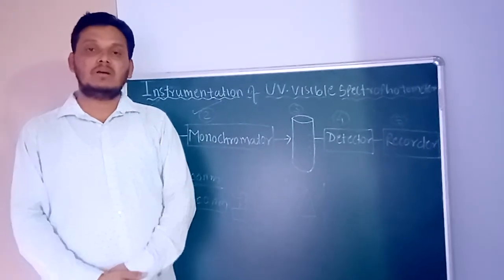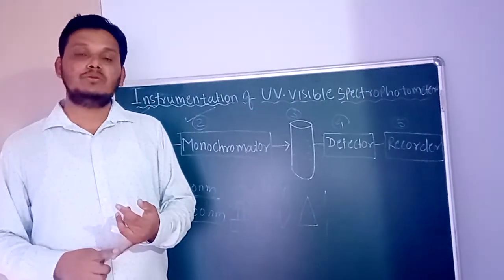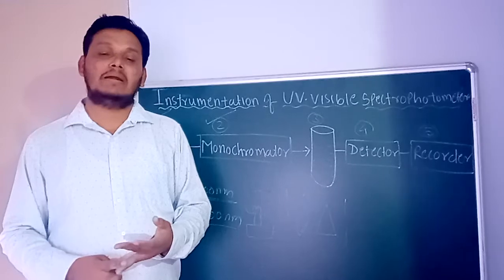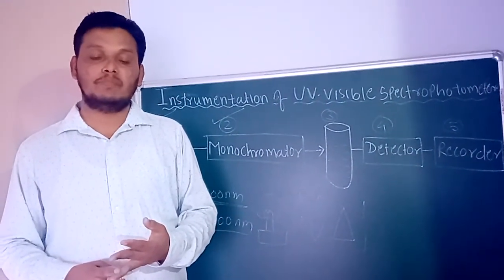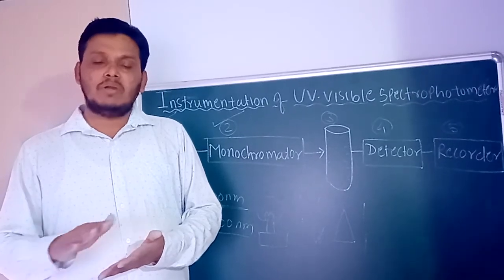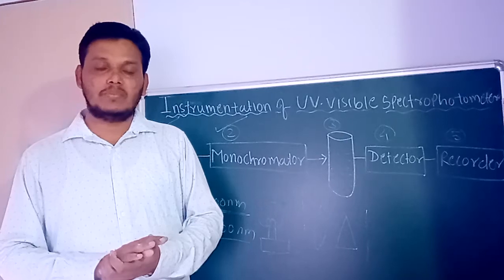So today we have seen two different concepts. Number one is the instrumentation of UV visible spectroscopy, and the second one is the application of UV visible spectroscopy.